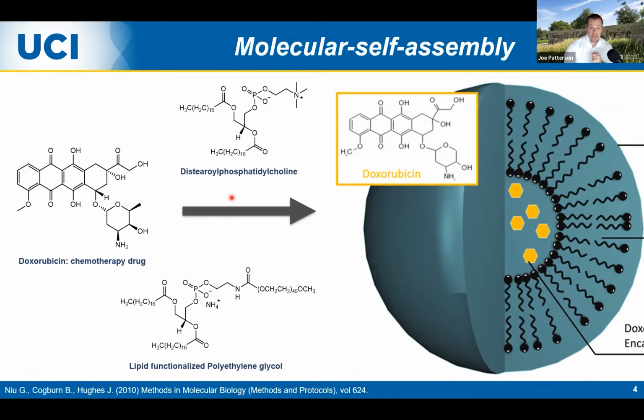And that process is complicated and it's really difficult to understand. And we use the term self-assembly because really the molecules kind of guide themselves into these structures. So we can't really, by ourselves, decide what the structure is. As chemists, we have to build molecules in a certain way and then put them under the right situations such that they organize themselves to make these structures. And that's really what my lab does. We try and understand the fundamentals of how molecular self-assembly works. And one of the ways that we do that is by imaging them with electron microscopes.